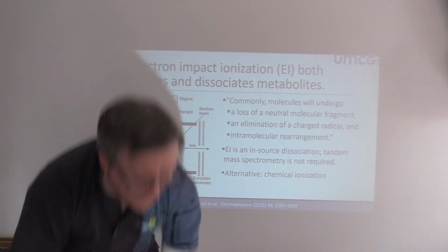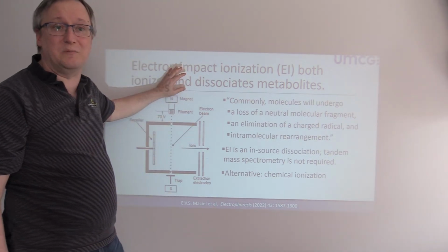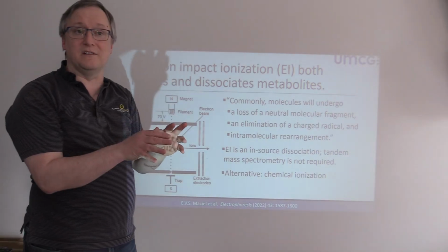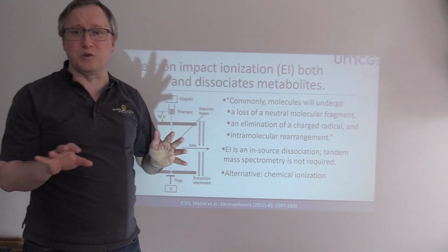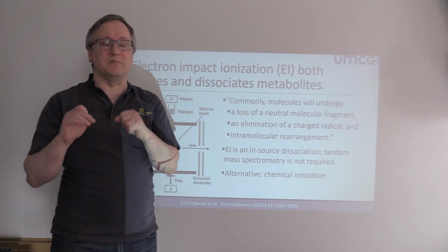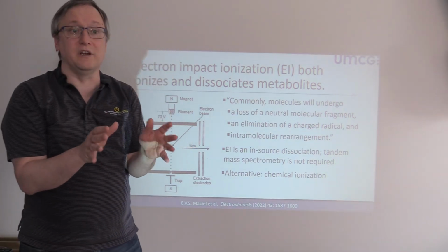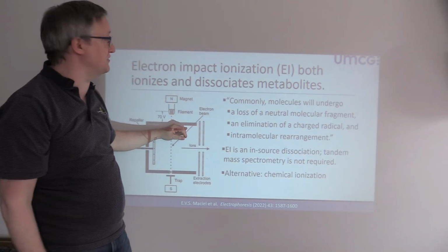Thank you, buddy. Okay, so electron impact ionization has been our best friend for this process. It's going to both produce ions and cause fragmentation. So this is a little unusual. If you're accustomed to thinking of electrospray ionization as something that just makes ions but doesn't really zorch the ions passing through it, you have to think about it quite differently in the case of electron impact ionization.